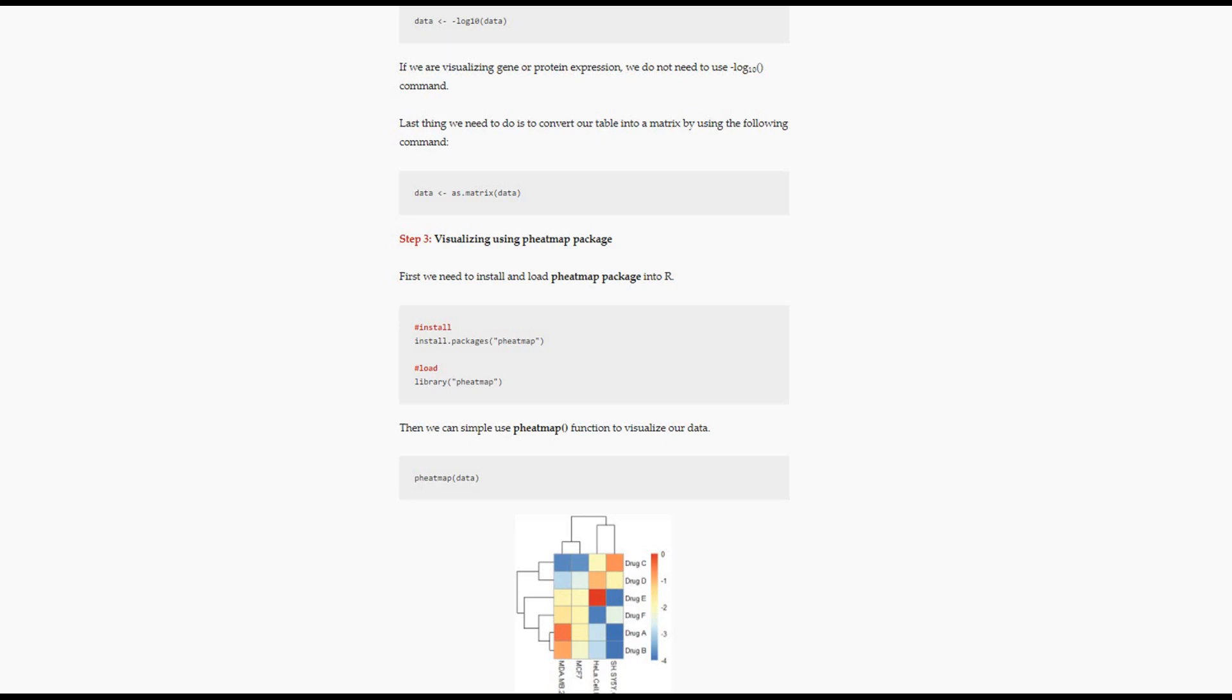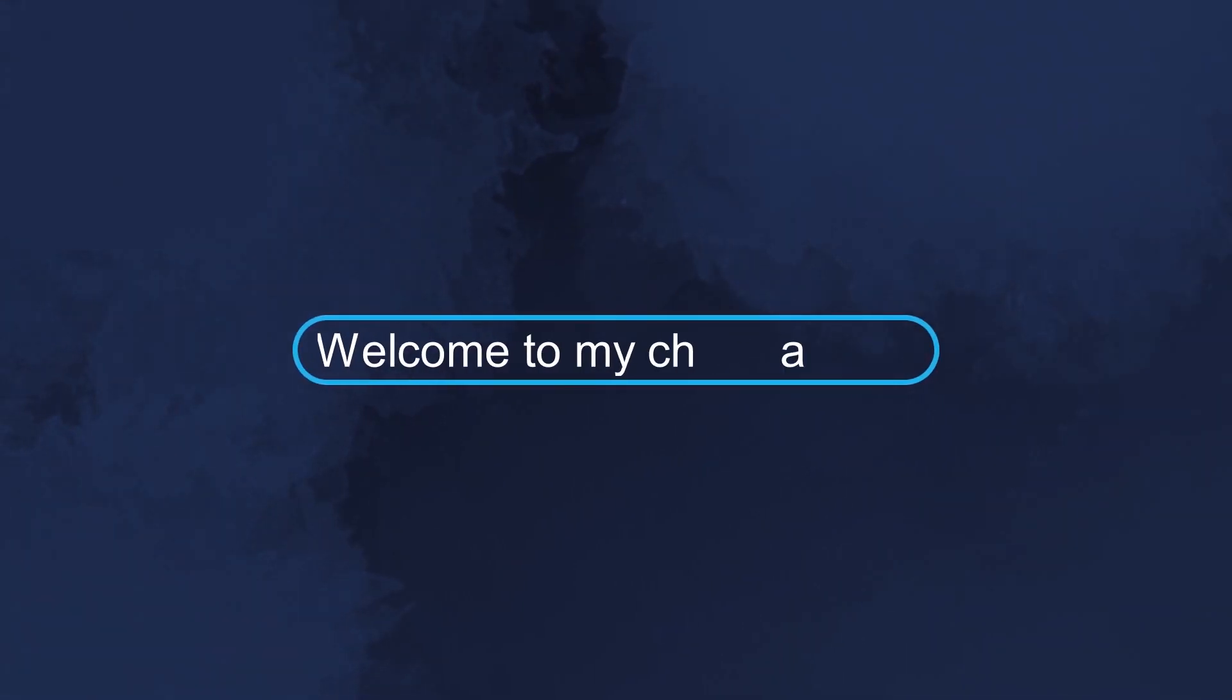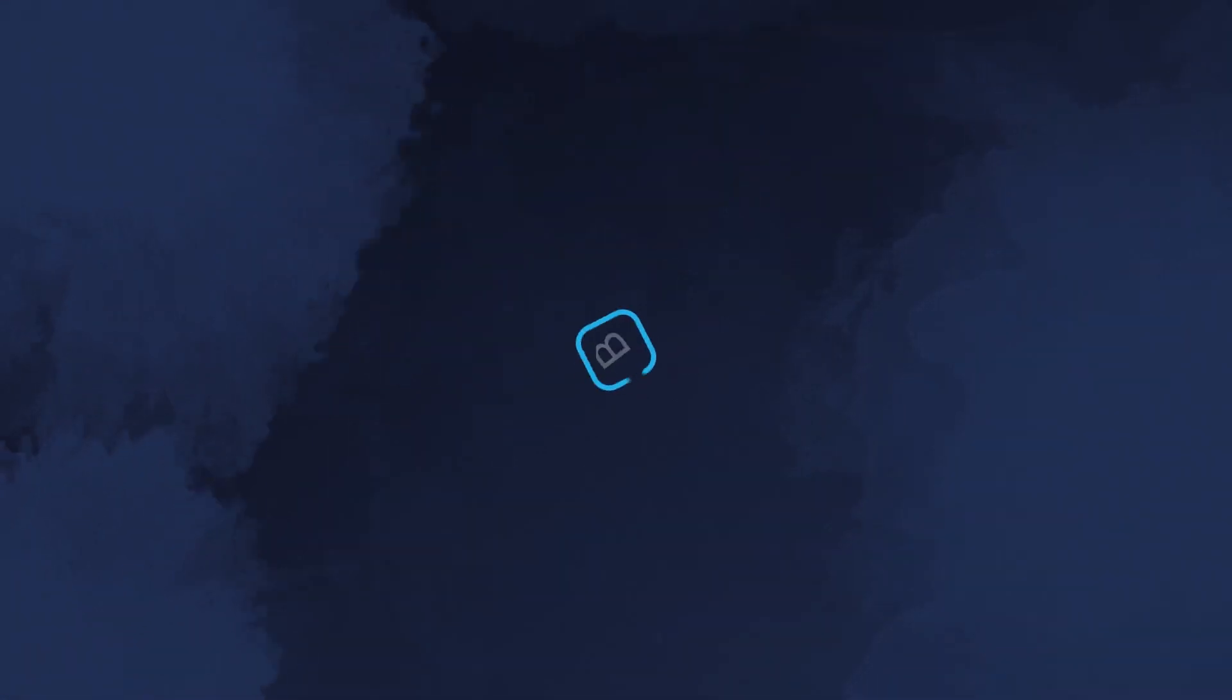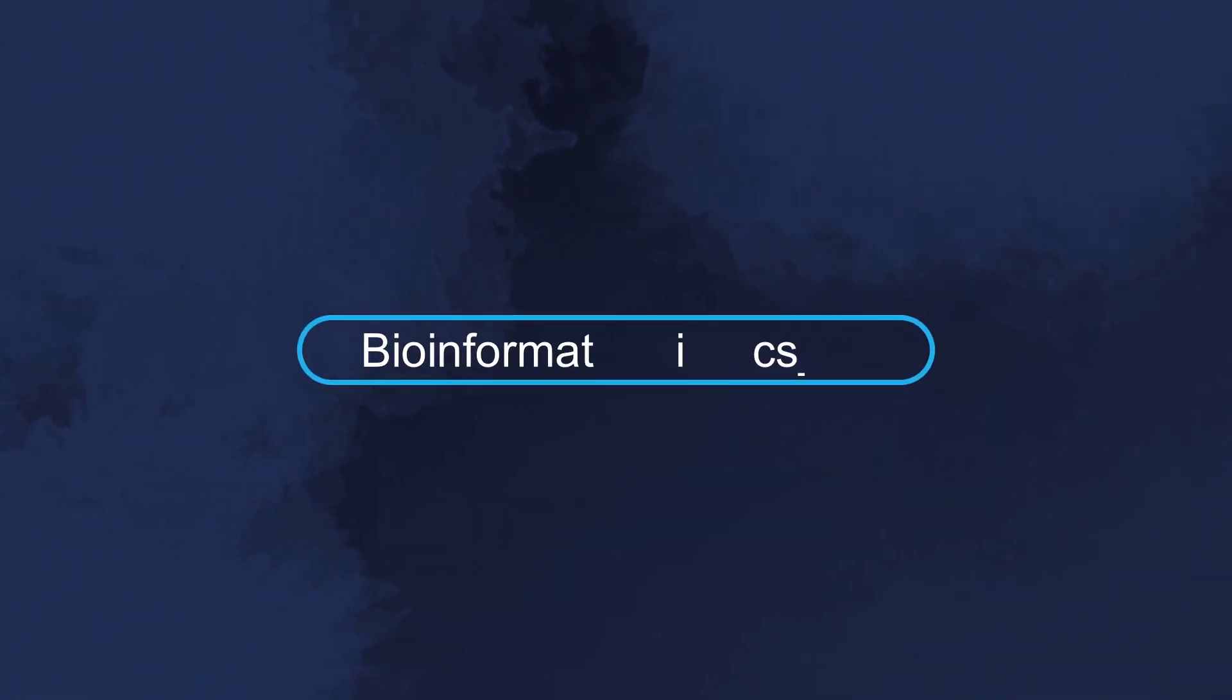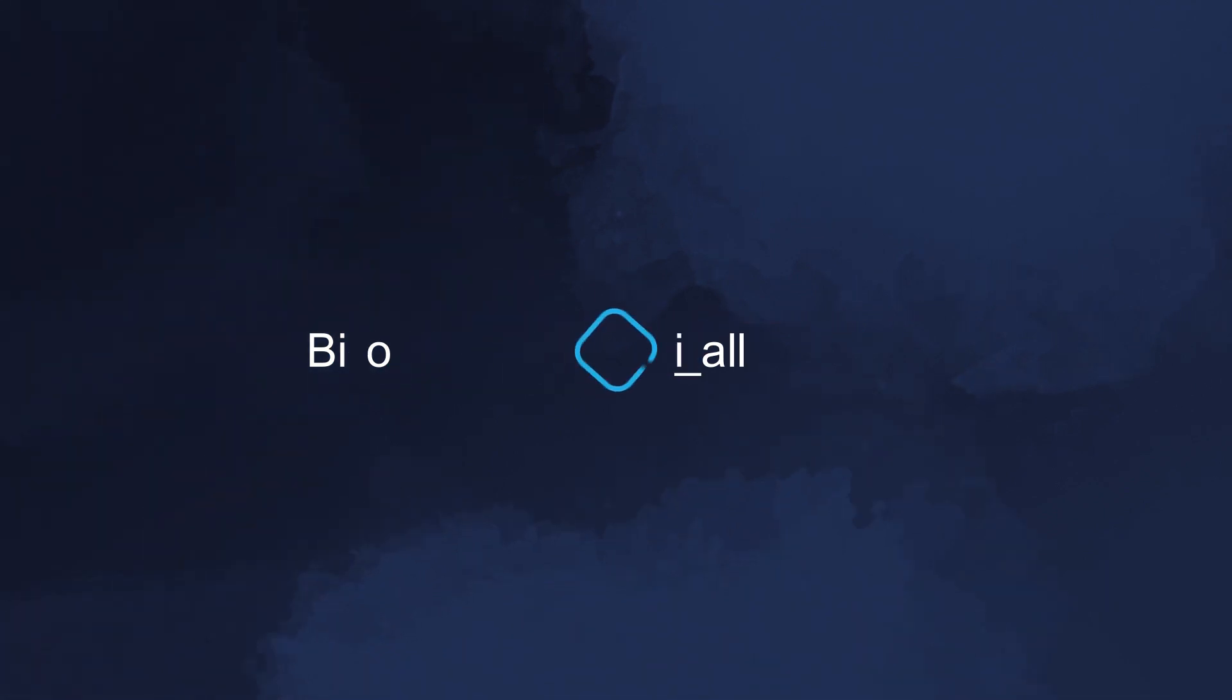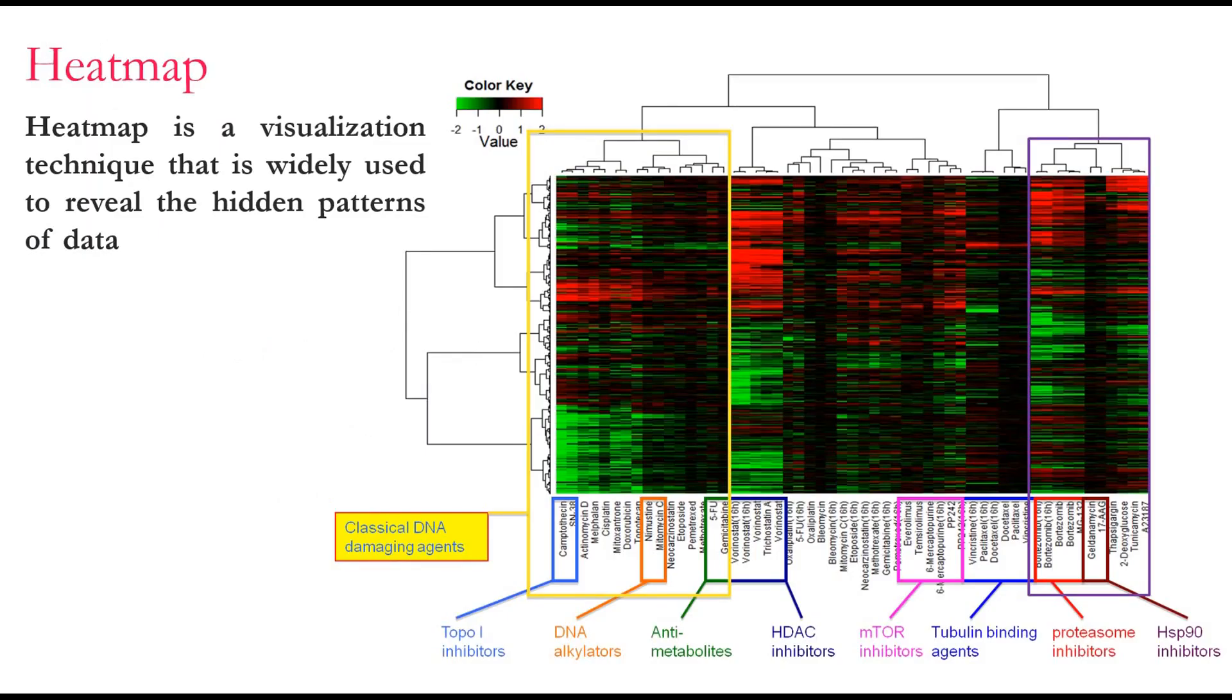So what's a heatmap? Heatmap is a visualization technique that's used widely to reveal the hidden patterns of the data. So if we have a huge set of data and we want to see if there is a hidden pattern, heatmap is a great way to use. It's not just visualizing the result, it's also clustering the result according to the row and according to the column.